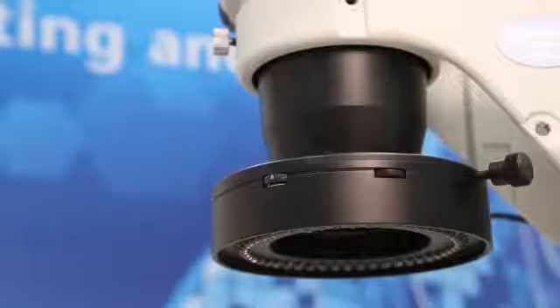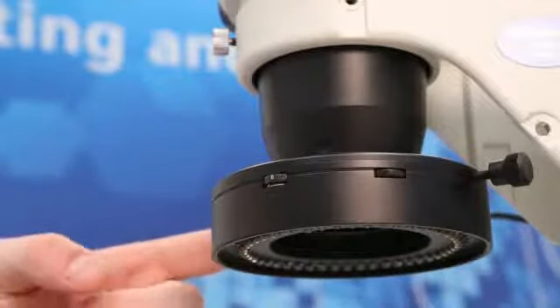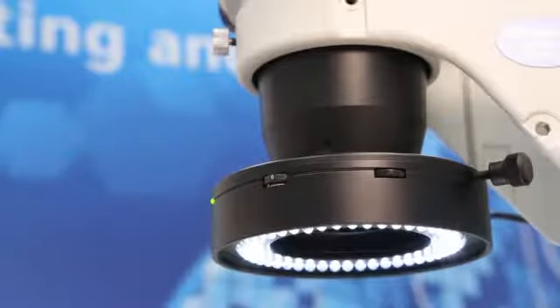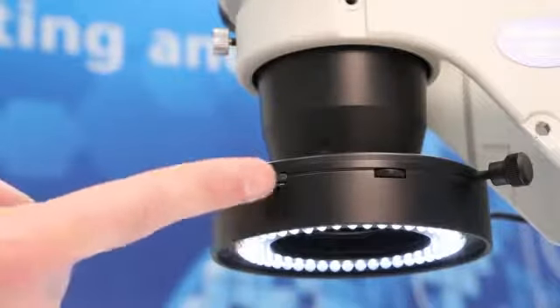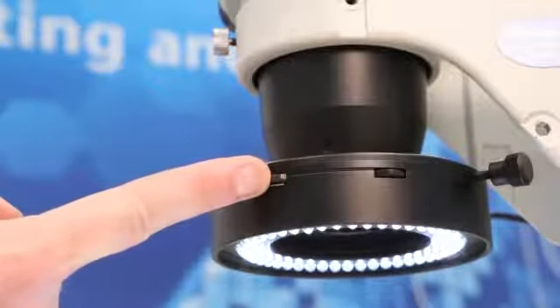All control elements are ergonomically integrated into the ring light. By turning the switch, a green LED power indicator shows that the ring light is ready to work. Next to the power indicator is a thumb wheel with a continuous scale from 0 to 10 in order to manage the overall brightness.